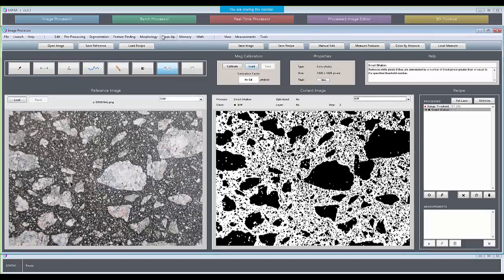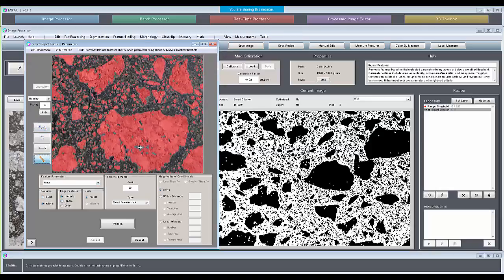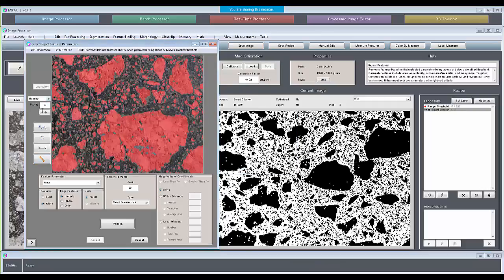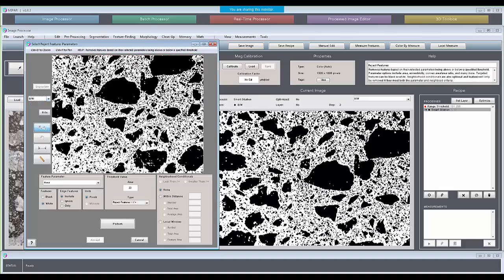Then we can do some hole filling, so we'll reject white features. Let's give a rough size scale estimate. That's 200 pixels. You can do true hole filling, which is just getting rid of any hole that doesn't touch the edge of the image. If I said target white features, ignore the edge ones, and get rid of anything that's under infinity, that's hole filling. You're now getting rid of all white holes that don't touch the edge.